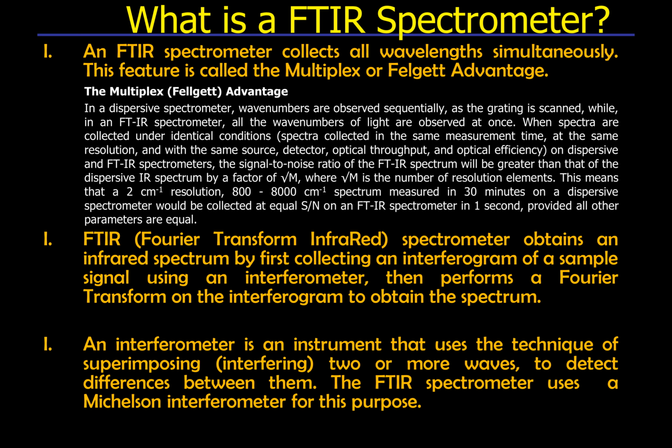An interferometer is an instrument that uses the technique of superimposing or interfering two or more waves to detect differences between them, and for this the FTIR spectrometer uses a typical interferometer called the Michelson interferometer.